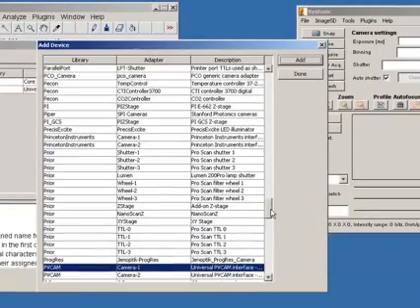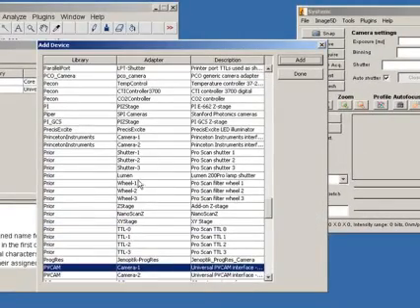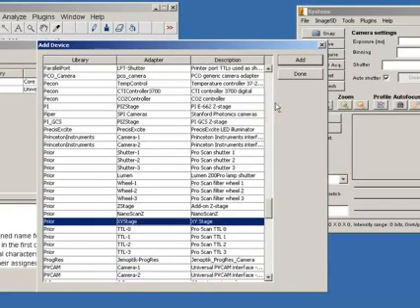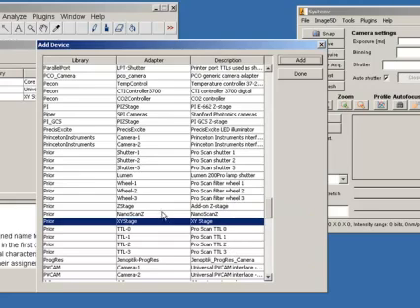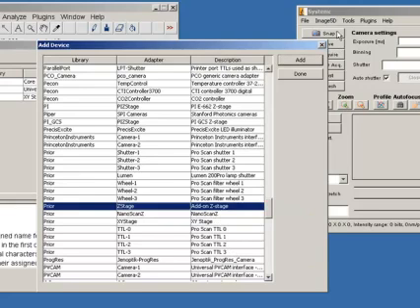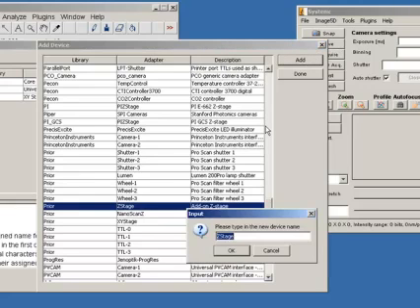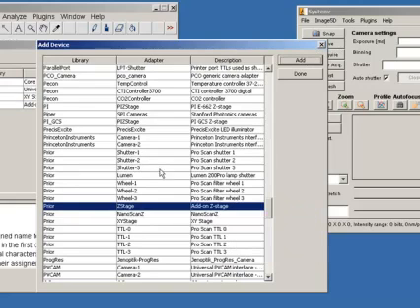Then, we've got a prior XY stage. So, let's add that one and give it a name so we'll click on prior stage. And then, we've got a prior focus drive. So, we'll add that.